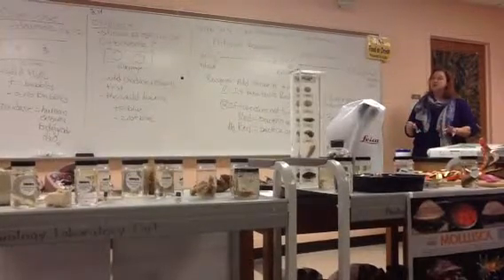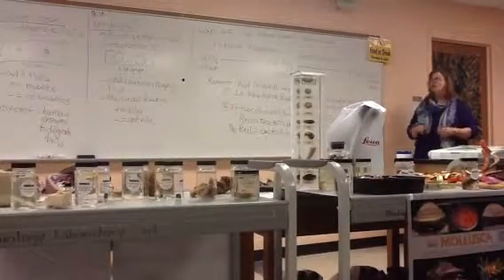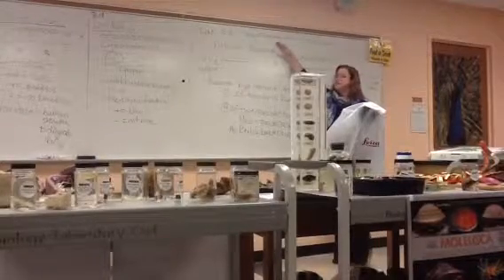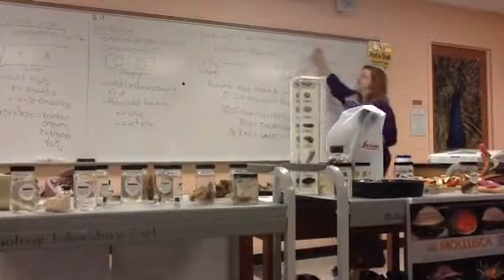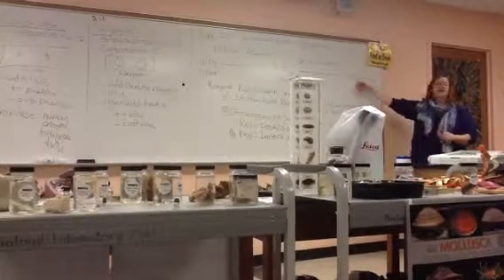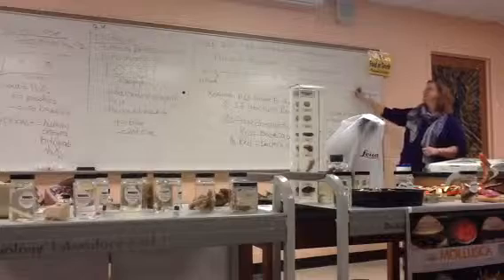So again, three possibilities. Positive for nitrate respiration, but negative for denitrification. Positive for both, negative for both. So how we're going to test which of those three options our bacteria are. We're going to be using nitrate broth, which, what do you think it has in it? It's nitrate, right? We're giving them a source of nitrate. And it's also got that Durham tube for collecting gas. What kind of gas are we hoping to collect this time? Nitrogen gas, right? Not carbon dioxide like with fermentation. Okay? That's why that little G is there. This is our gas, nitrogen gas.